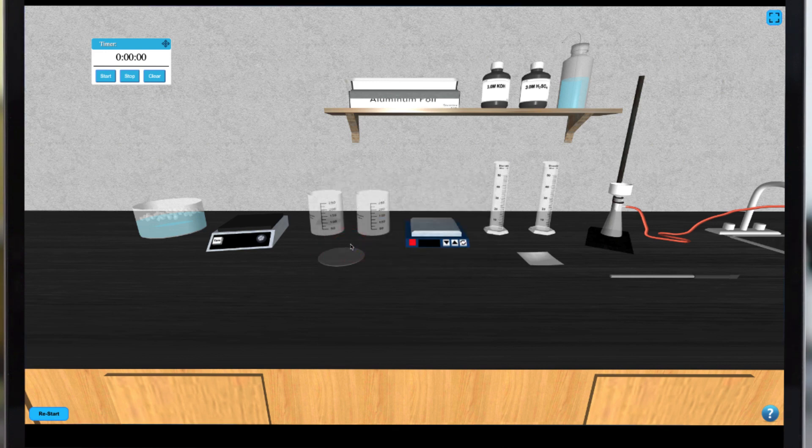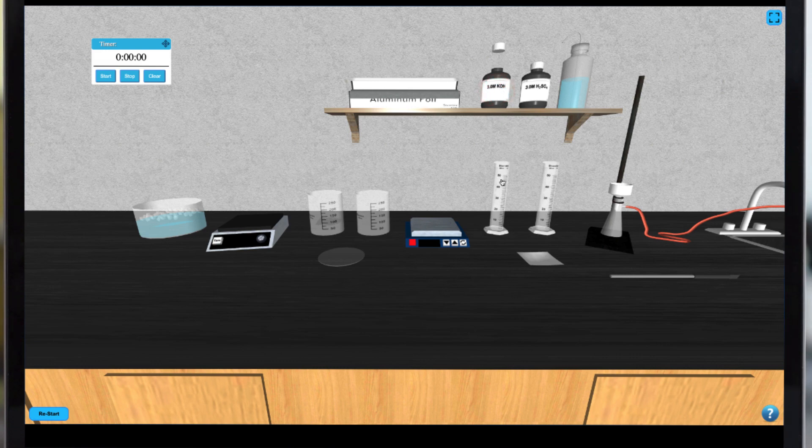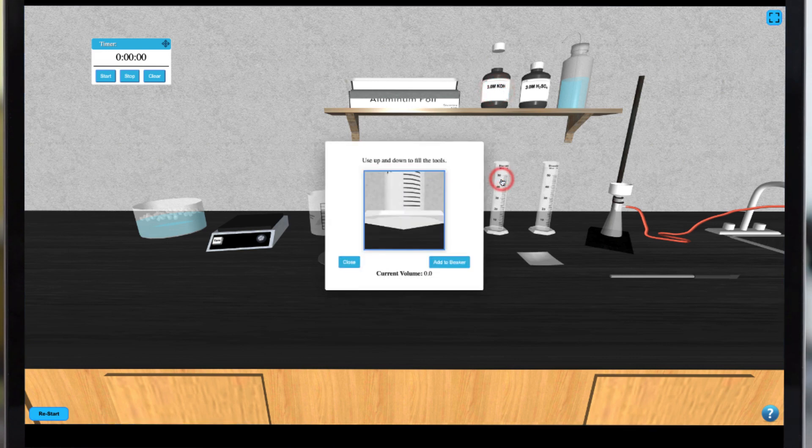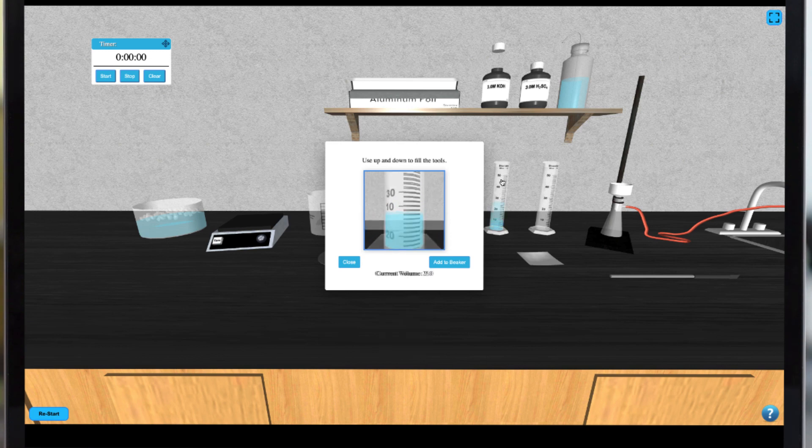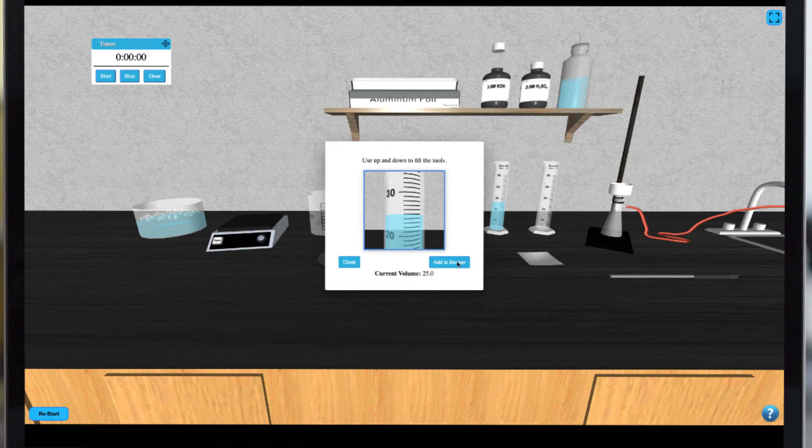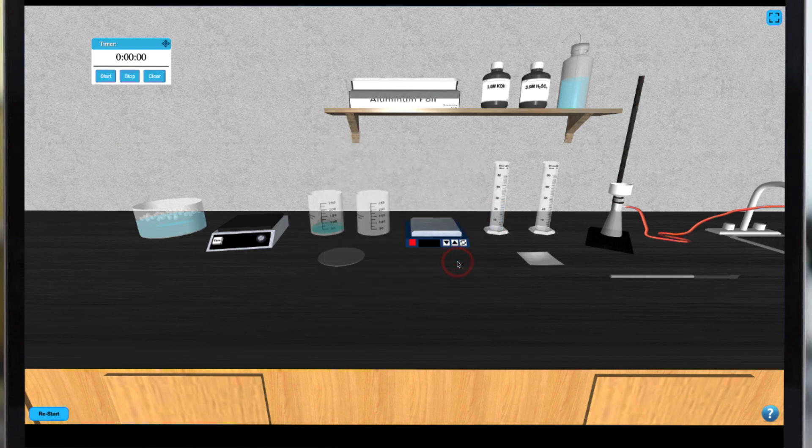We can obtain our potassium hydroxide by clicking on it and then selecting the graduated cylinder to choose a specific volume. Use your arrow keys to increase or decrease the desired volume. Once added the aluminum will begin to dissolve and this will take about a minute.